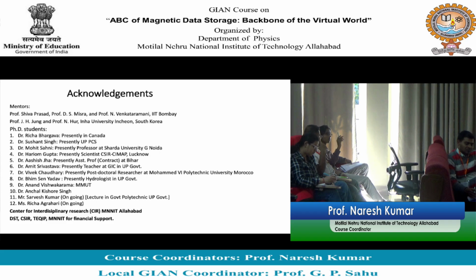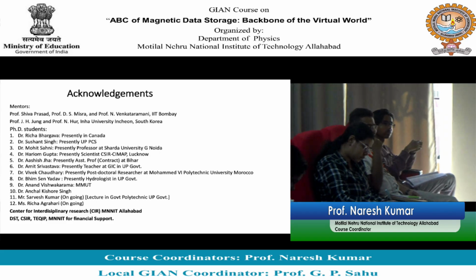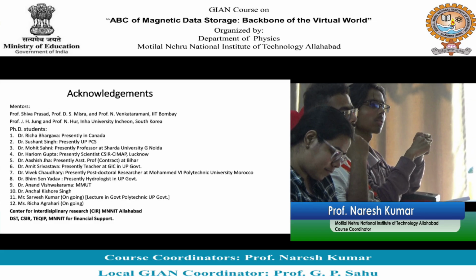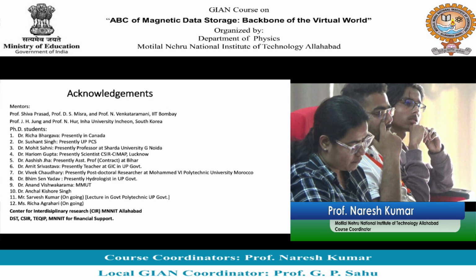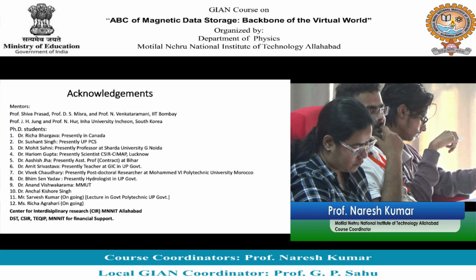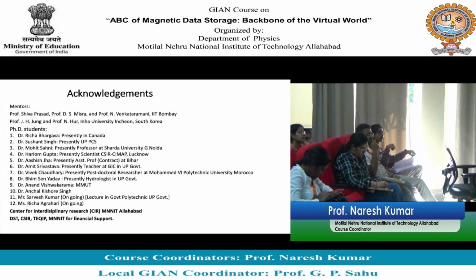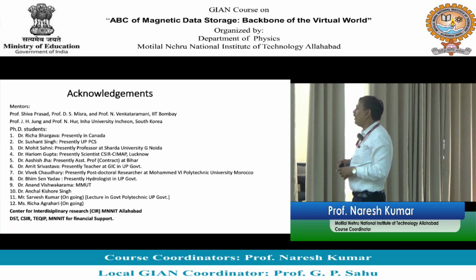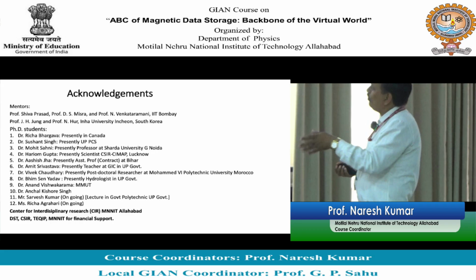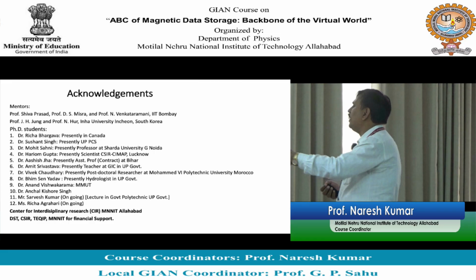हाँ. नहीं नहीं नहीं, assume नहीं करना पड़ेगा सर. आपके पास तो ये जैसी PDF फाइल चेक करना पड़ेगा. It is your XRD will give you just these peaks. So firstly you need to see theta, फिर देखेंगे आपके पास सातों crystal structures हैं, 14 Bravais lattices हैं, उन सबकी फाइल को चेक करना है. लेकिन आसान क्या है, जैसे मान लीजिए I am taking iron and oxygen. So I know this is iron oxygen, so it's an oxide. So tentatively, let me see, this will give you a tentative cubic structure.